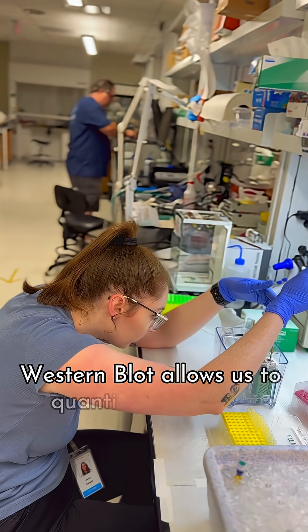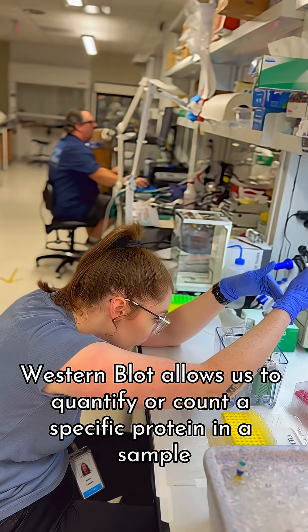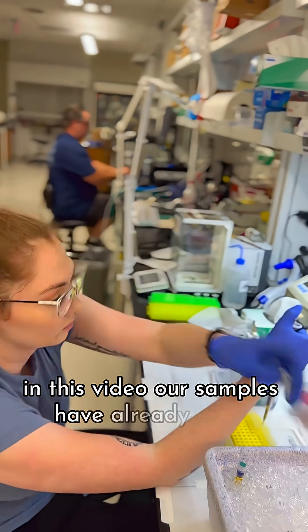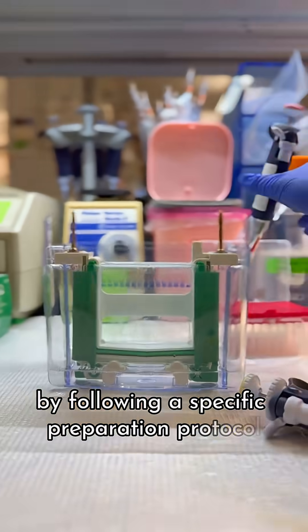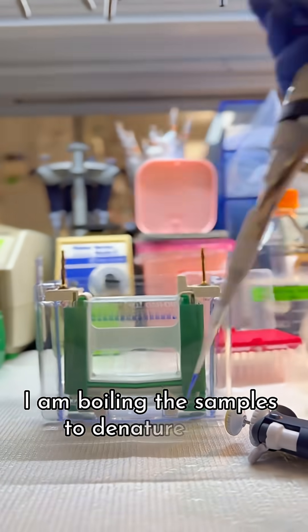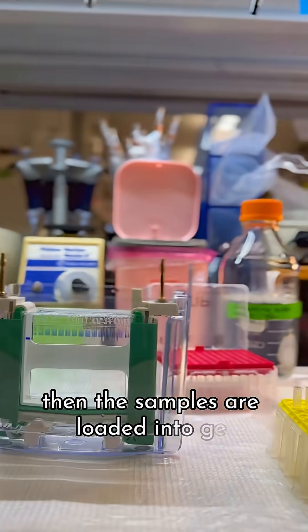Western blot allows us to quantify or count a specific protein in a sample. In this video, our samples have already been prepared by following a specific preparation protocol. I am boiling the samples to denature them, or help them unfold from their normal structure. Then the samples are loaded into gel.